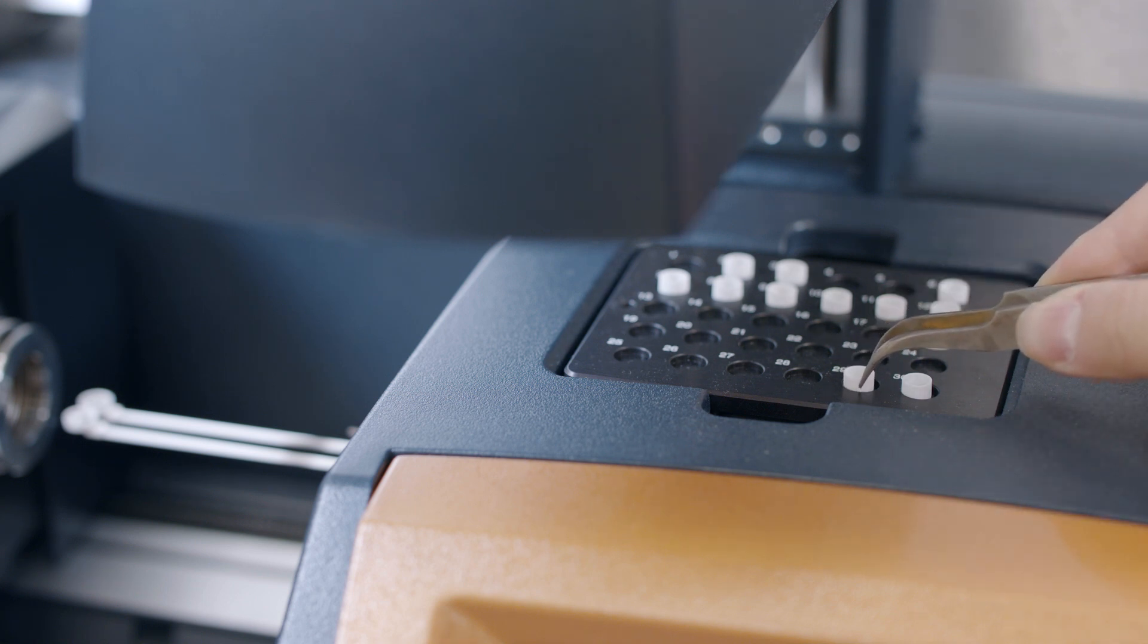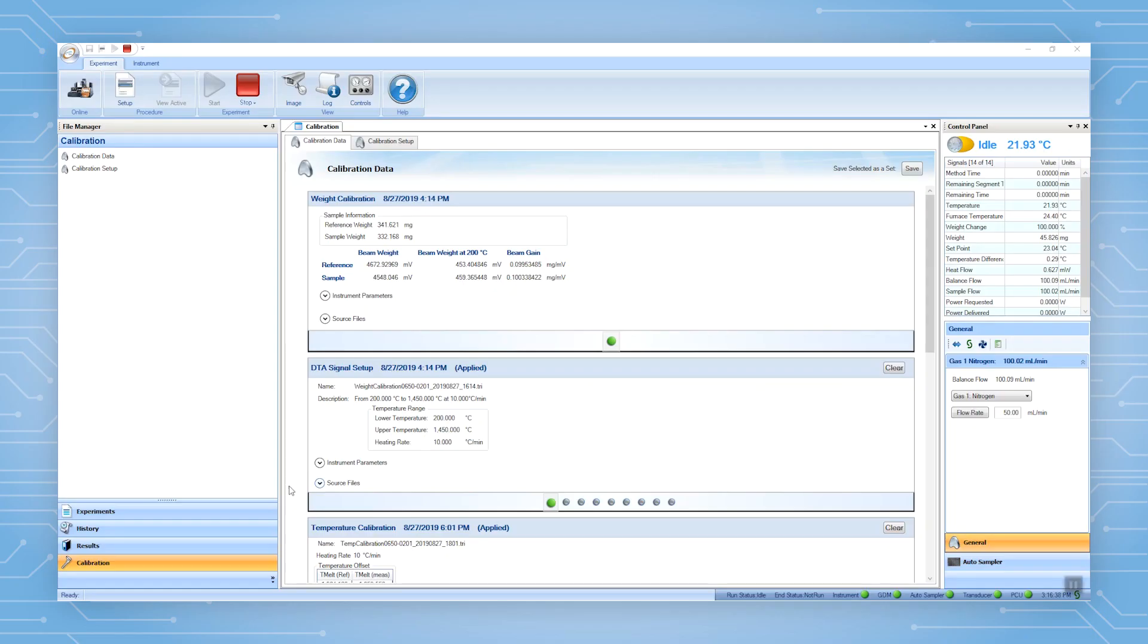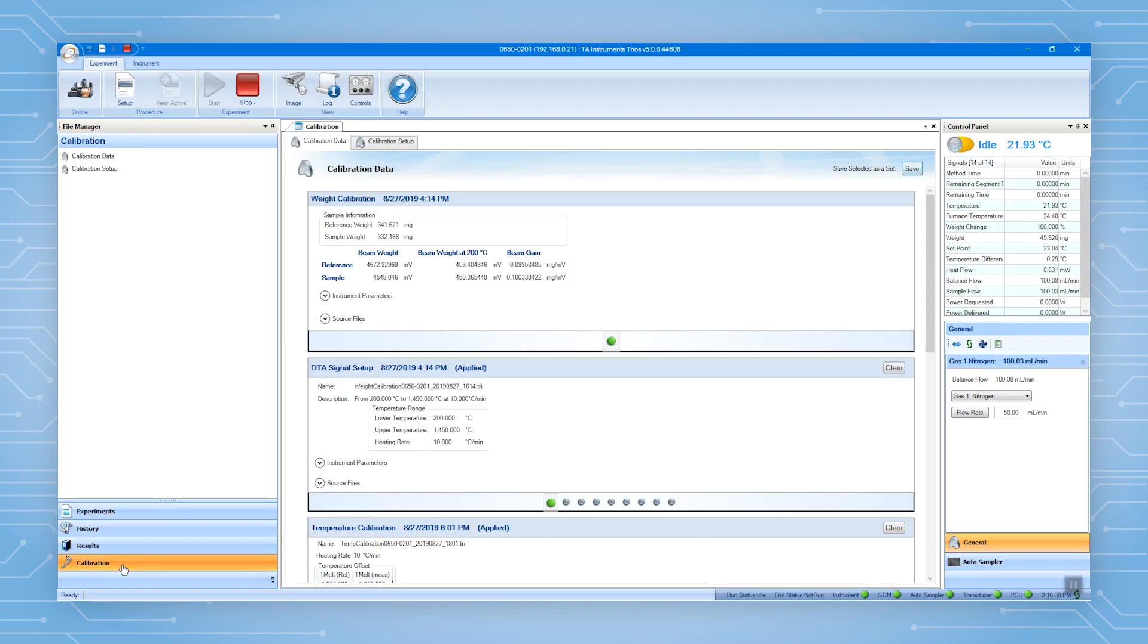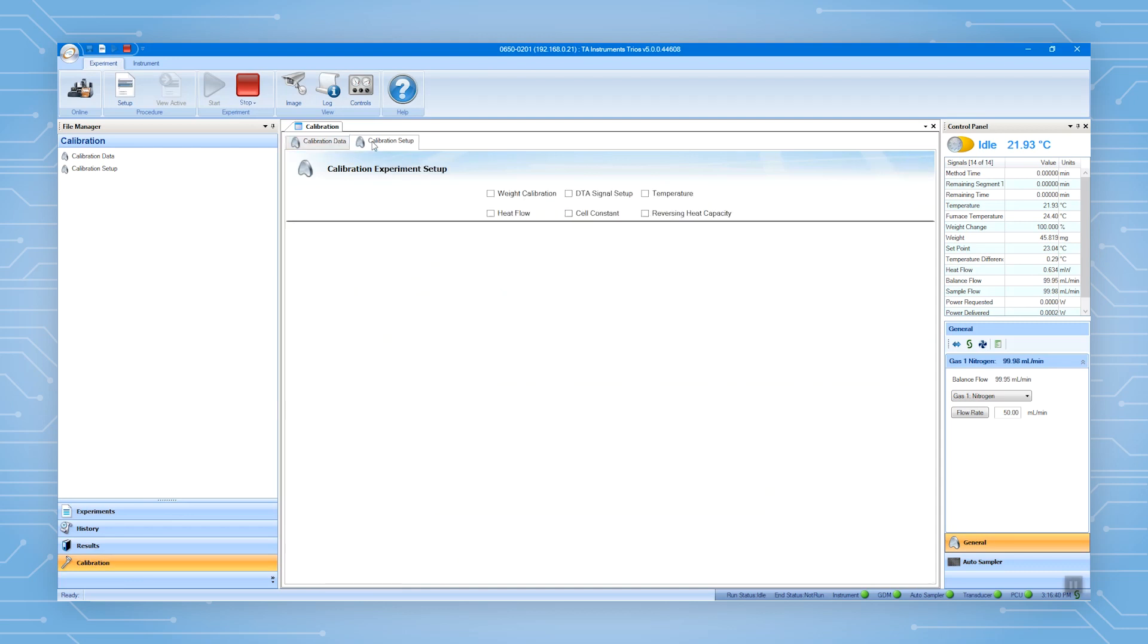Then go to Trails. Use the calibration to set up the tests. In calibration setup, select weight calibration.